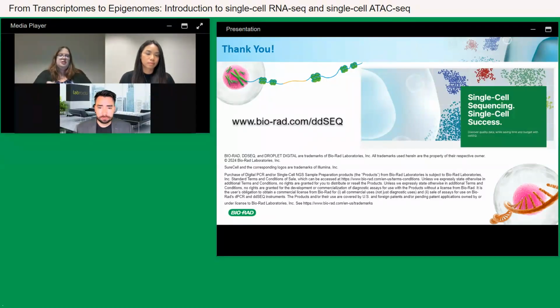We can do that if there are 2 beads in a droplet, 3, 4, as many beads as are in the droplet. We can use this Jaccard index to help determine which ones were in the same droplet and which ones weren't. In the case of the 3' RNA-seq, we use deconvolution oligos that are unique to each of those beads. Those oligos are capture sites that are unique compared to the capture sites on other beads, but aren't going to align to the genome.